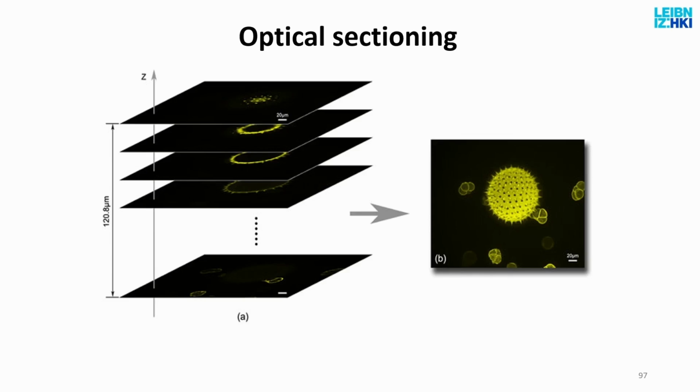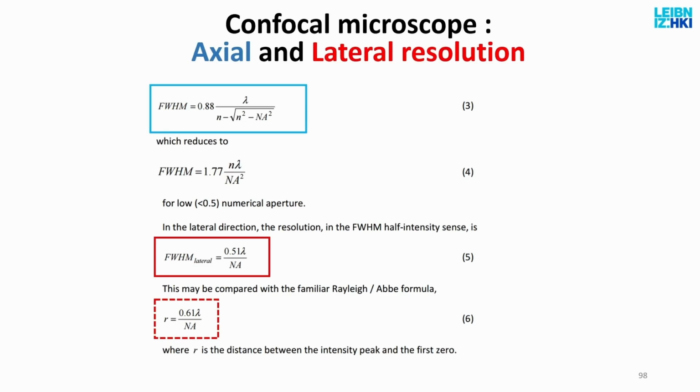The point at the pinhole, like I said, you only get signal from maybe a micrometer thick layer, depending on the pinhole size. So you have to have a lens to scan through the sample in the Z direction as well. And this also means that the three-dimensional image that you see is the result of calculation by your computer. You don't see it per se as a real image. Also, there is no image in a confocal microscope. It's just current and integrated current, so you have to calculate the image. So you don't see anything without a computer.